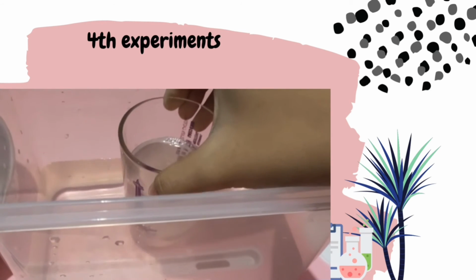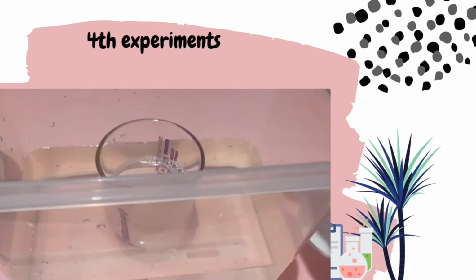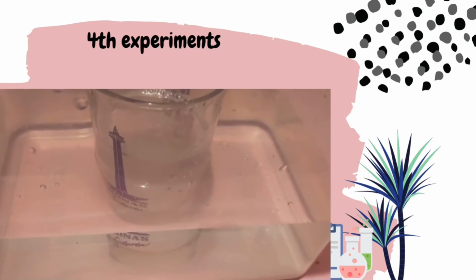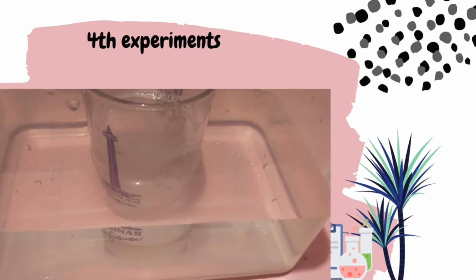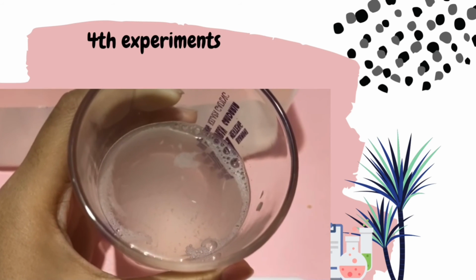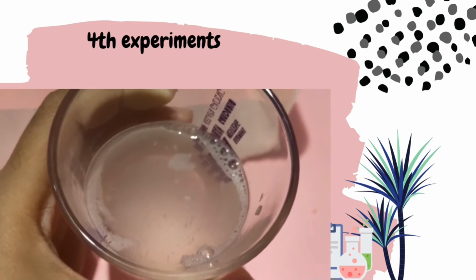The function of the bowl is to normalize the temperature of the glass. If the temperature is already normal, we can see the salt water. There are lumps inside.